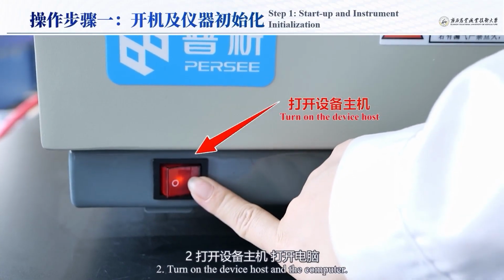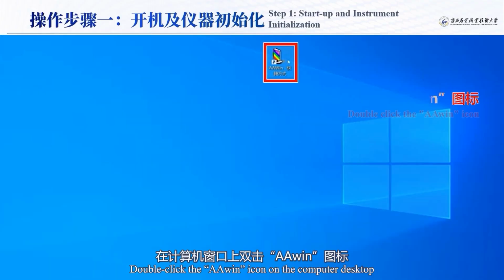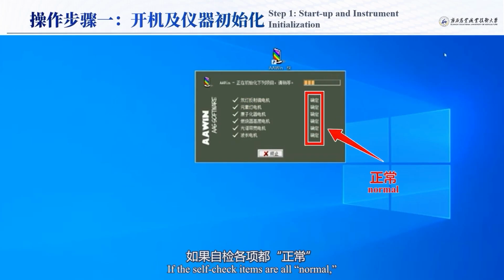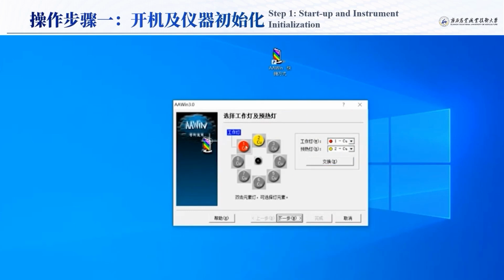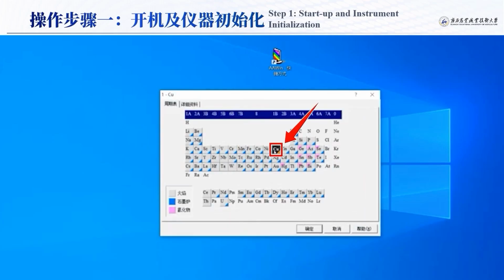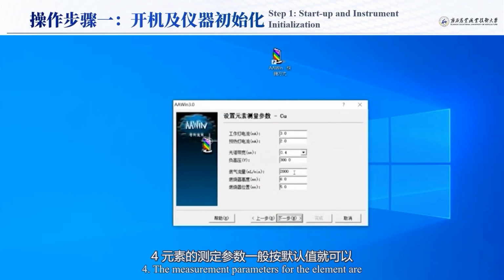Second, turn on the device host and the computer. Click the AAwin icon on the computer desktop and click Connect to initialize the instrument. If the self-check items are all normal, the instrument will automatically enter the interface for selecting the working lamp and preheating lamp. Third, select the Cu work lamp and preheat lamp, and follow the prompts for the next step. Fourth, the measurement parameters for the element are usually set to the default values. Click Next.